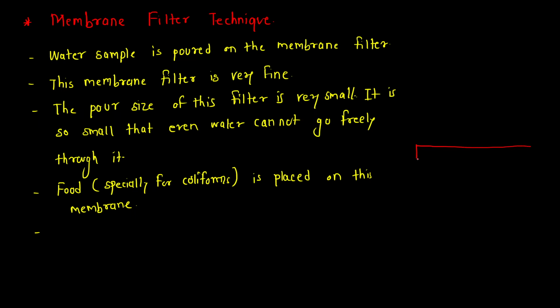See, there is one filter paper. In this we'll call this the membrane filter.